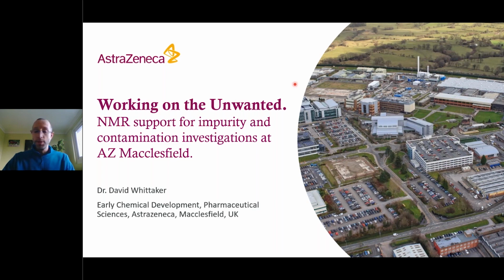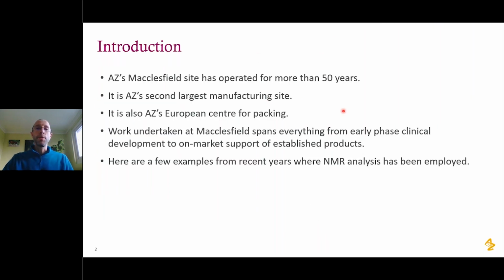As was just mentioned, the site where I work is concerned with all aspects of projects, ranging from early phase development through to on-market technical support and manufacturing of established products. And what I'd like to do in my presentation today is give three real-life examples of where we've had to carry out impurity or contamination investigations, and particularly how we've used NMR in these investigations.